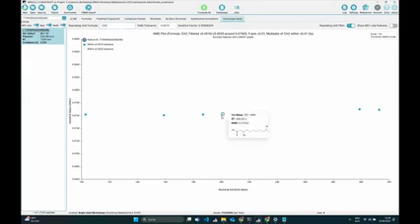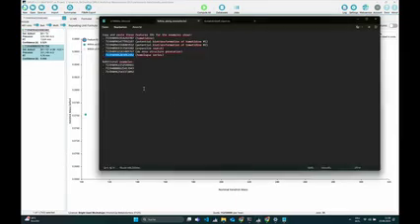But yeah, you can now just hover over these dots. And what you can also do is you can right-click on one of them and directly jump to the feature if you want to look at the feature in this homolog series. Okay, but now something else.